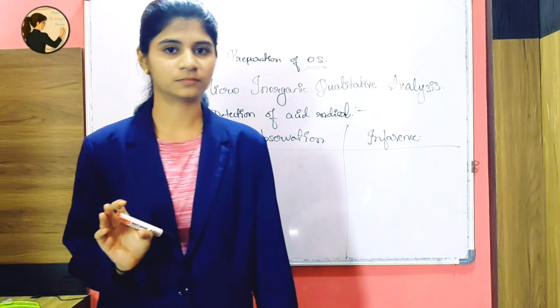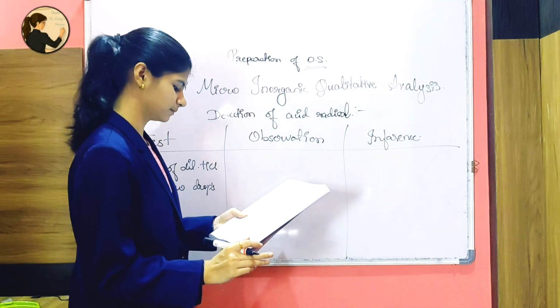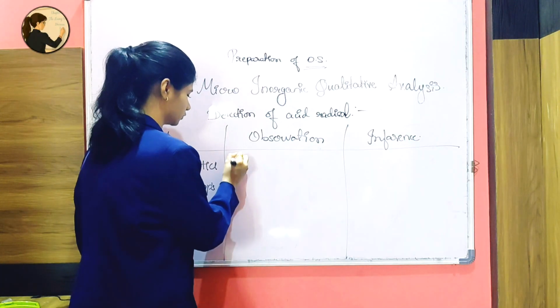Now you will wait, you will watch what will happen next. Then in observation, there is no effervescence of CO2 gas.